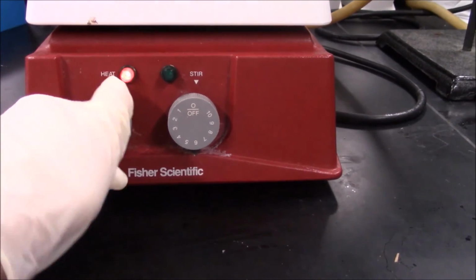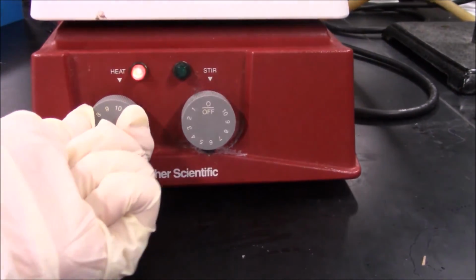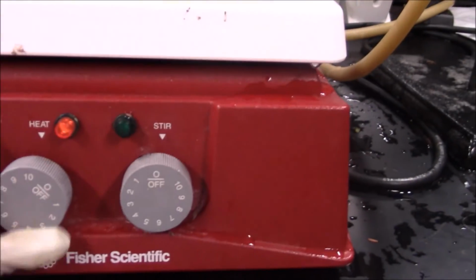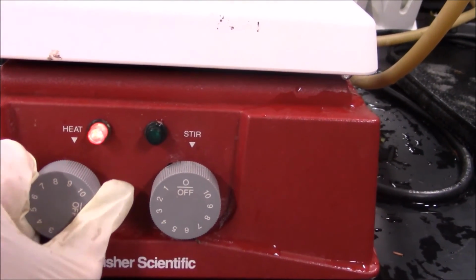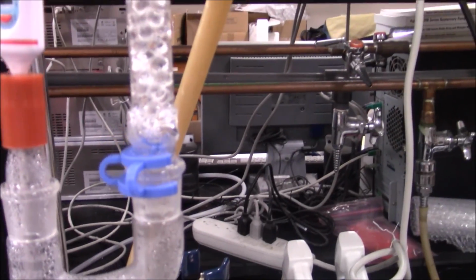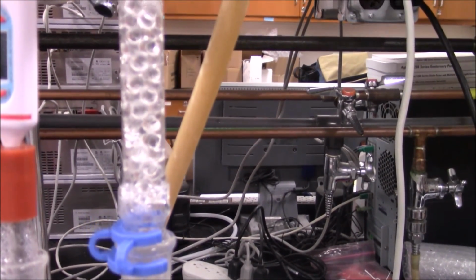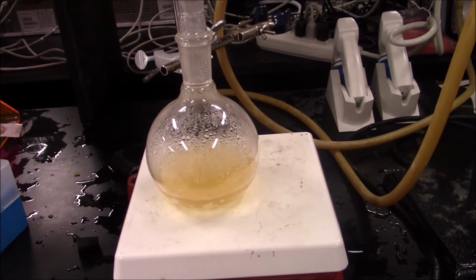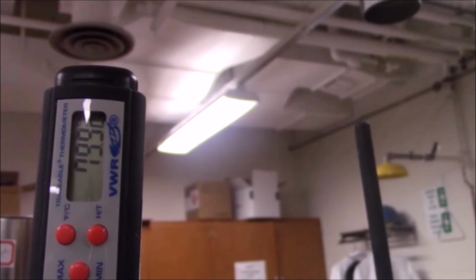To begin distillation, turn the heating plate to high power. Once the solution begins to boil, reduce the temperature slightly, but keep it high enough to allow vapor to pass all the way to the top of the column, where vapor will condense on the digital thermometer and the thermometer reading will go up to the boiling point of ethanol. Ensure that the solution continues to boil throughout distillation.